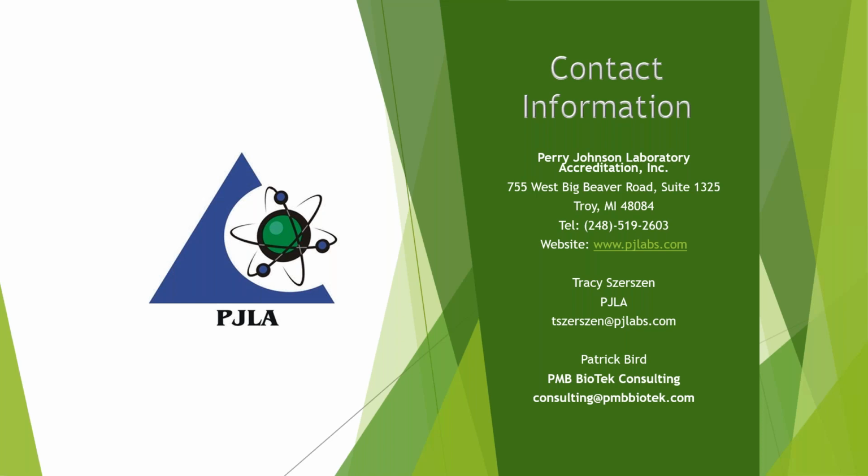Are you aware of any proficiency tests that are available for this? When you mean proficiency tests, right now there are a couple organizations that are preparing hemp samples, and I think Emerald Scientific is the largest group that is selling them. So their samples can be used with molecular methods or any of these methods to do PT samples.